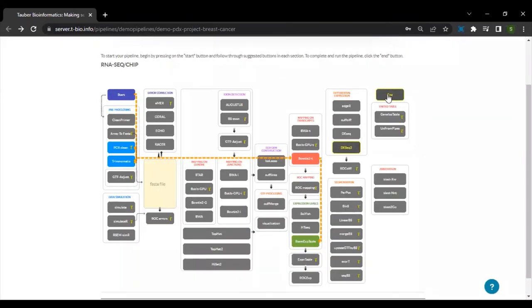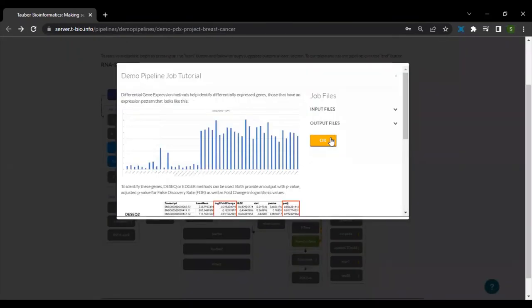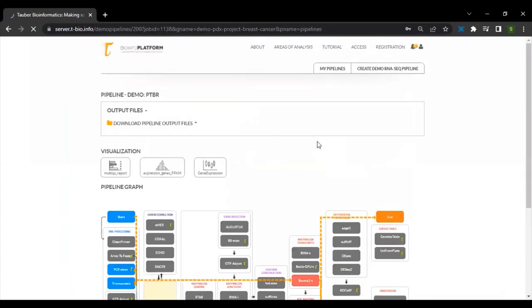Click on end to end the pipeline. With that, we have built our very first RNA-seq pipeline using breast cancer samples.